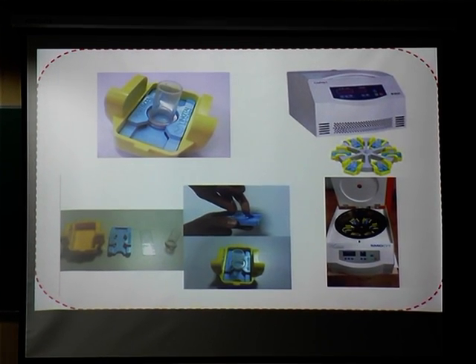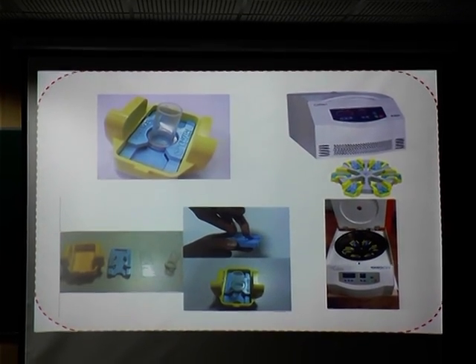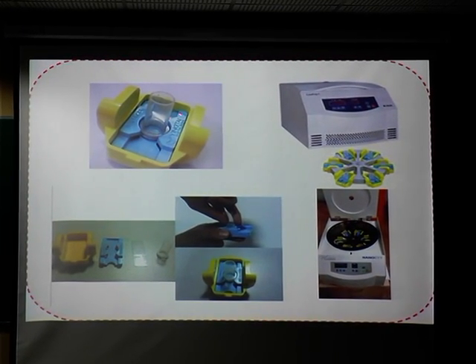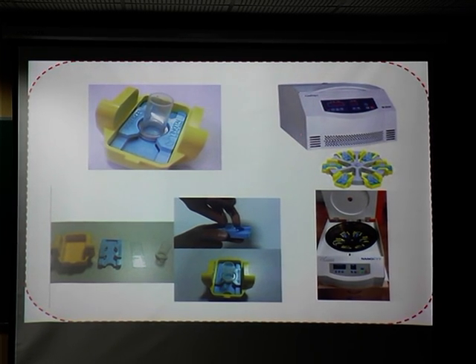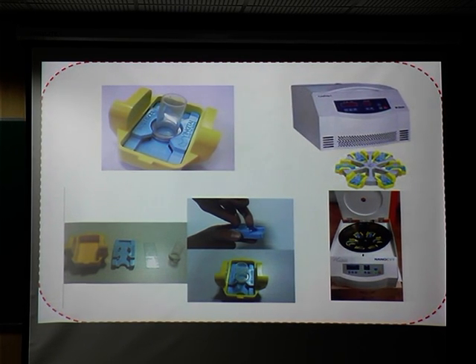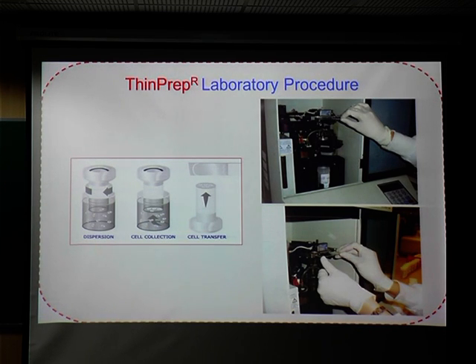Now a lot of companies have come up and they have started their semi-automated type of monolayer preparation. So this is the cassette, this is how the chamber is there, there is a slide over here and it spins, and they are coming up with different innovations, and you have the semi-automated, like the UPrep company is marketing that a lot, and any and every medical college or even a private setup can afford to have that type of preparation.